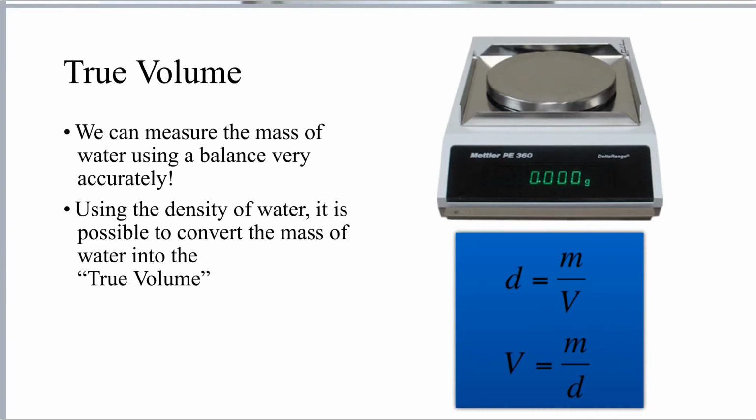And the cool thing about the balances is that these balances cost about $1,000, and so we can assume that because this balance is well cared for and calibrated, this mass is the true mass.